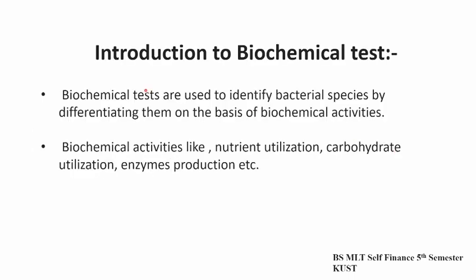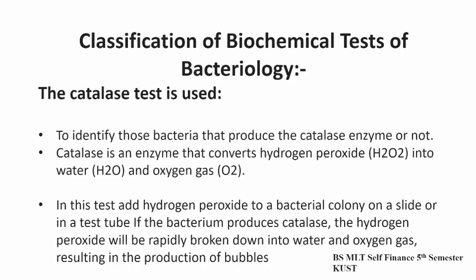Introduction to the biochemical tests. Biochemical tests are used to identify bacterial species by differentiating them on the basis of biochemical activities, like nutrient utilization, carbohydrate utilization, enzyme production, etc.